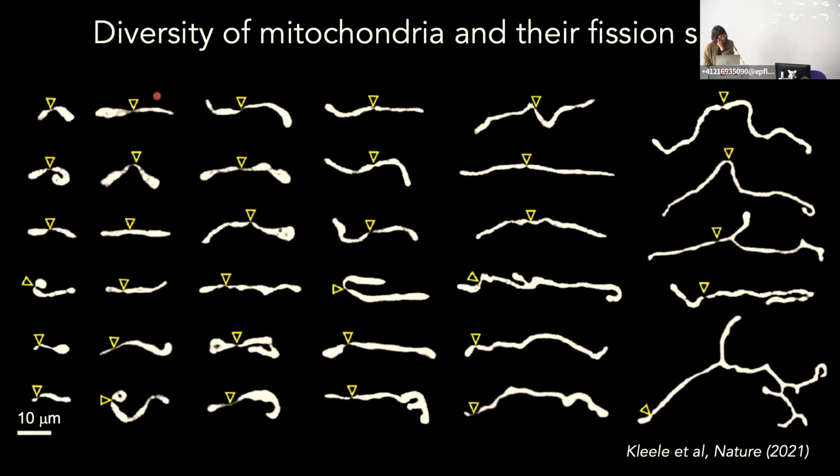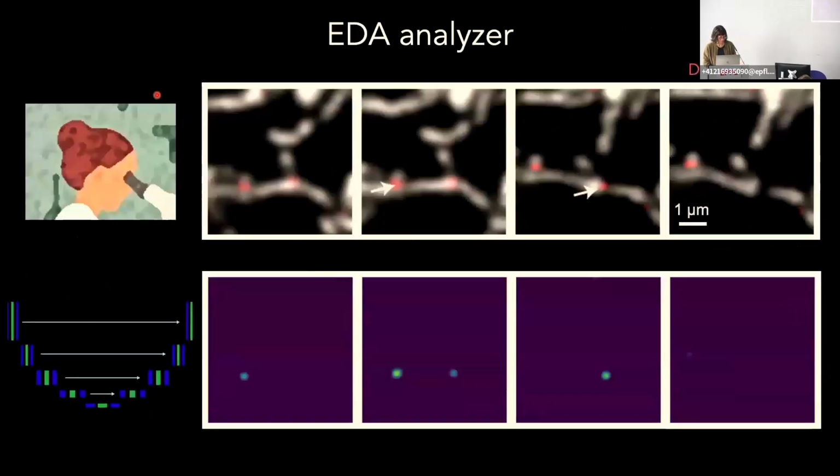And we did this not only through identifying where these sites were, but also by defining a ground truth. And this was an important element. What is the actual event score that we will assign to each of these sites? I'm not going to go into the details of that here, but it turns out to be quite an important problem. So we trained a relatively classical architecture, a UNet architecture, with this kind of data.